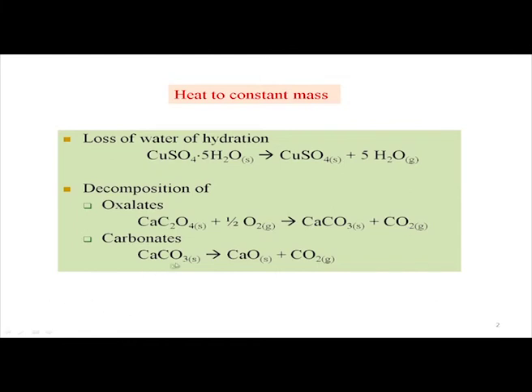Similarly, in this particular case, in the second step, we do not need any kind of oxygen for the decomposition, it is directly going out. So, calcium carbonate will be degraded into calcium oxide. We know the use of calcium oxide, that when it is trapping water, we get slaked lime and all these things. So, this also can give rise to carbon dioxide from the particular sample.